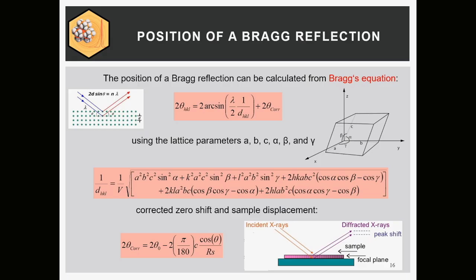And these are all parameters which can be subjected to refinement, because you want to have the perfect values for your lattice and maybe also for the aberration of your instrument. And then it's clear that if this is just one tiny little equation in the Rietveld equation out of maybe 20 we are using, then the whole formula cannot be analytical anymore. Okay?